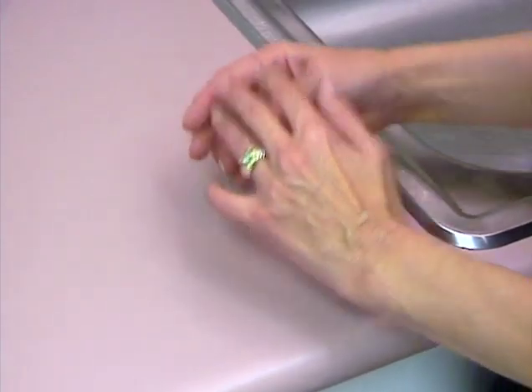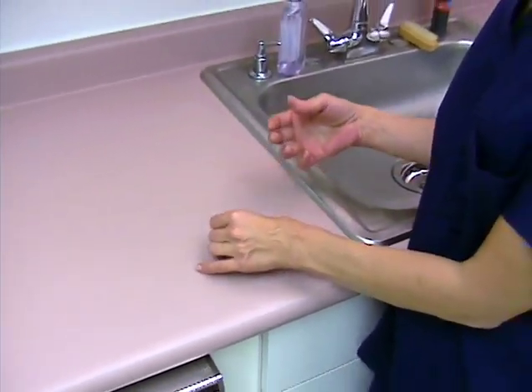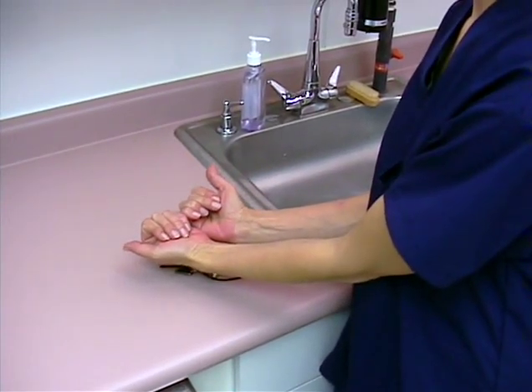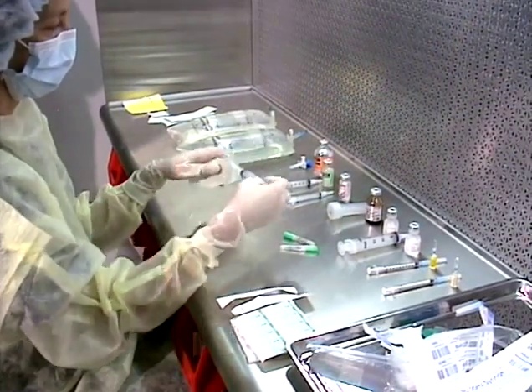Next, gowning of admixtures personnel should take place. Operators should remove all jewelry from the hands and wrists. Dangling necklaces and earrings should also be removed, and no makeup or nail polish should be worn. This will prevent the transfer of particulates to the buffer zone and critical sites.